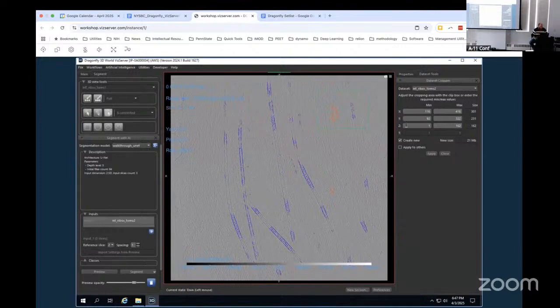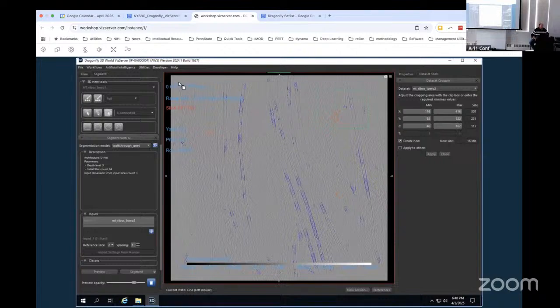Okay, so what I do is I click on the slice thing and I drag it downward until I find the bottom of the region that I'm interested in. So I'm going to go to whatever the bottom of those ribosomes are until they're out of the view. And then I'm going to look at what slice number that is. It's 46 out of 162. So in the Z minimum, we're going to put 46.